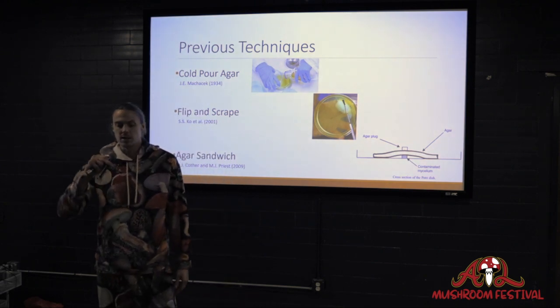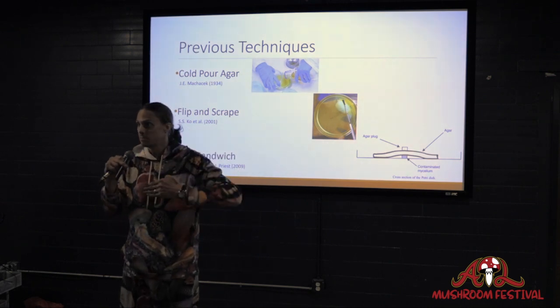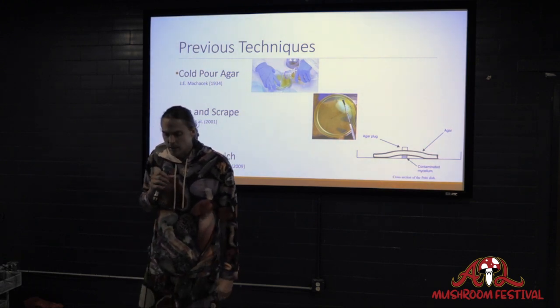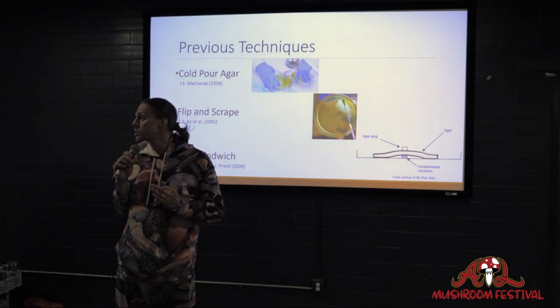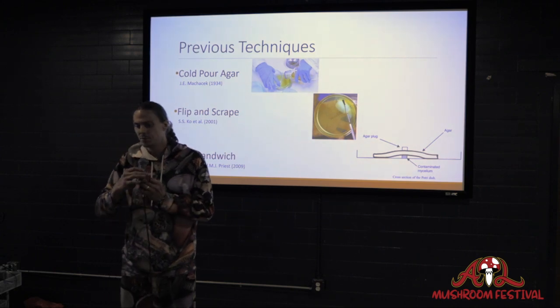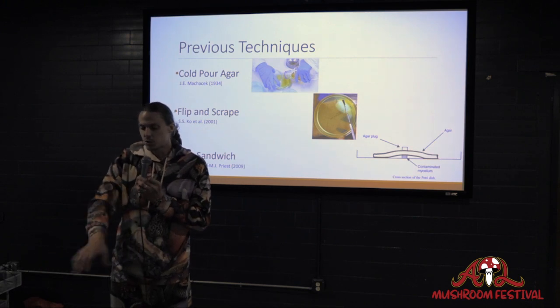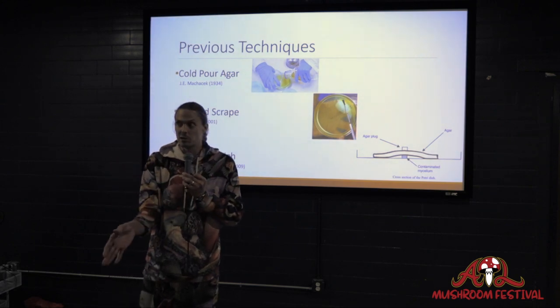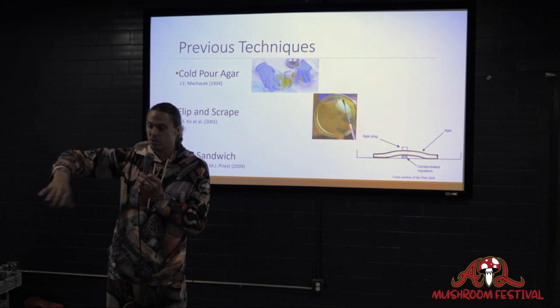The fungal contaminants can, but it does slow it down to some degree. Sure. Yes. And for the most part, you're going to have to rely on your experience with that culture and your knowledge and your expertise of knowing what is and what isn't. So you already know what is. You're like, I want this thing to grow. And you have some experience with what that looks like. And then you just kind of make a separation. Anything that doesn't look like this ain't right. And so you just keep running away from the stuff that doesn't look like what you want.